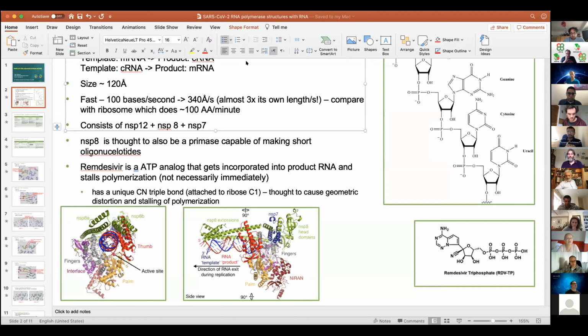So let me just share my screen then. Out of all of the maps, at least the ones that I have seen, there are only about 4 or 5 with half maps. And in some sense, that's kind of the biggest problem. Yeah, that should be made compulsory. So if anyone here wants to write to these authors and suggest, with gentle pressure, that they send the half maps or deposit their raw data to EMPIAR and so on, that would be really helpful as well.